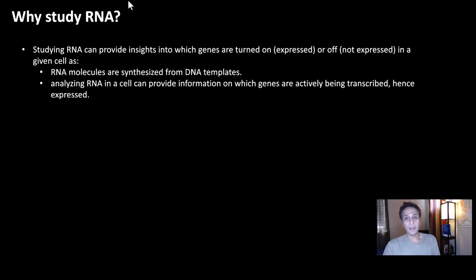Now, why study RNA? We already established the case that we ideally would like to understand information down to a protein level, not really at a DNA level. Of course, that's also important, but information at the protein level is even more useful. Studying RNA can provide insights into the genes that are actually turned on. When you read papers, you will encounter different terminology. I'm calling them turned on or off, but sometimes you read them as expressed genes, or you'll hear the term gene expression.